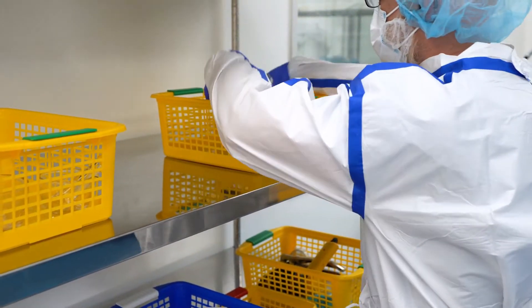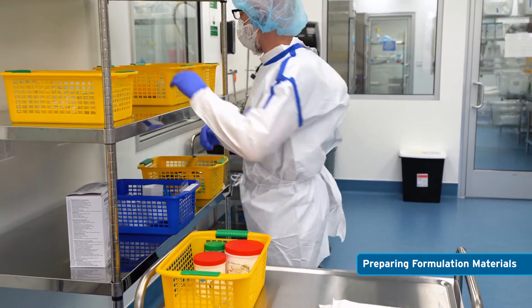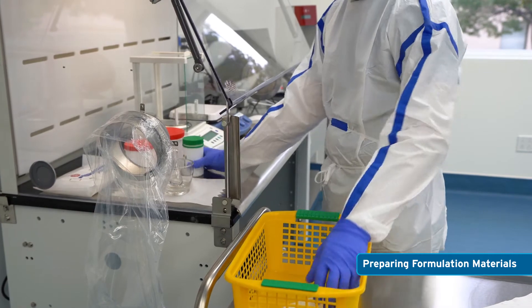All chemicals, utensils, glassware, and other materials should be placed inside the CVE so that the technician does not have to remove their hands from inside the CVE during powder handling.